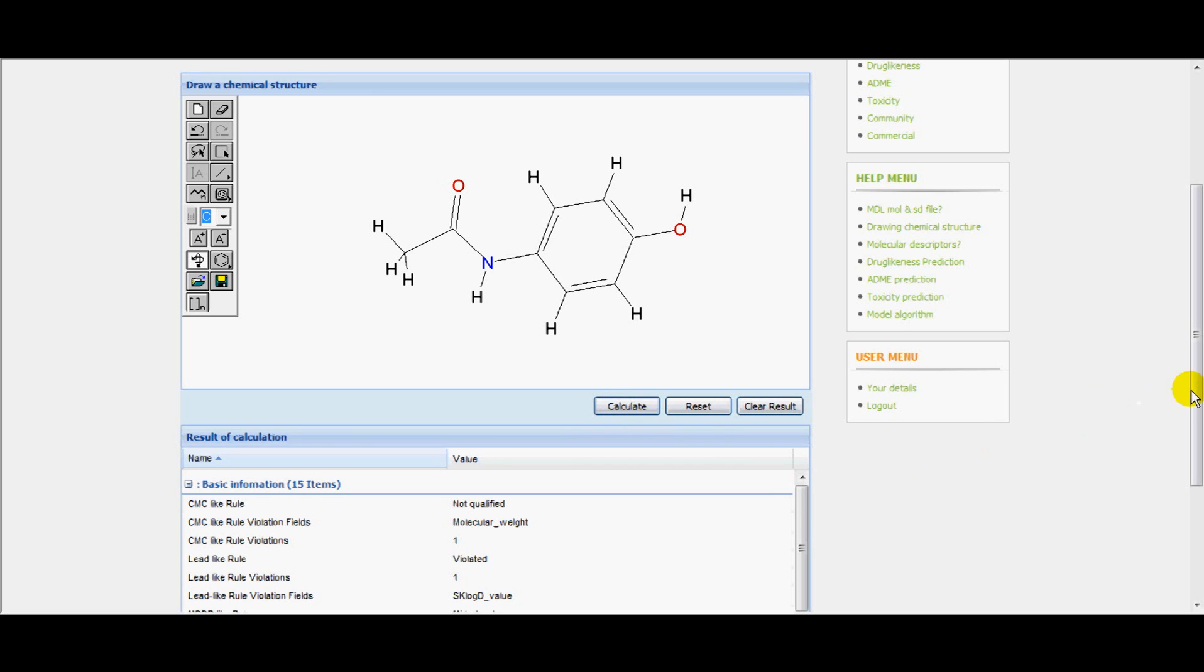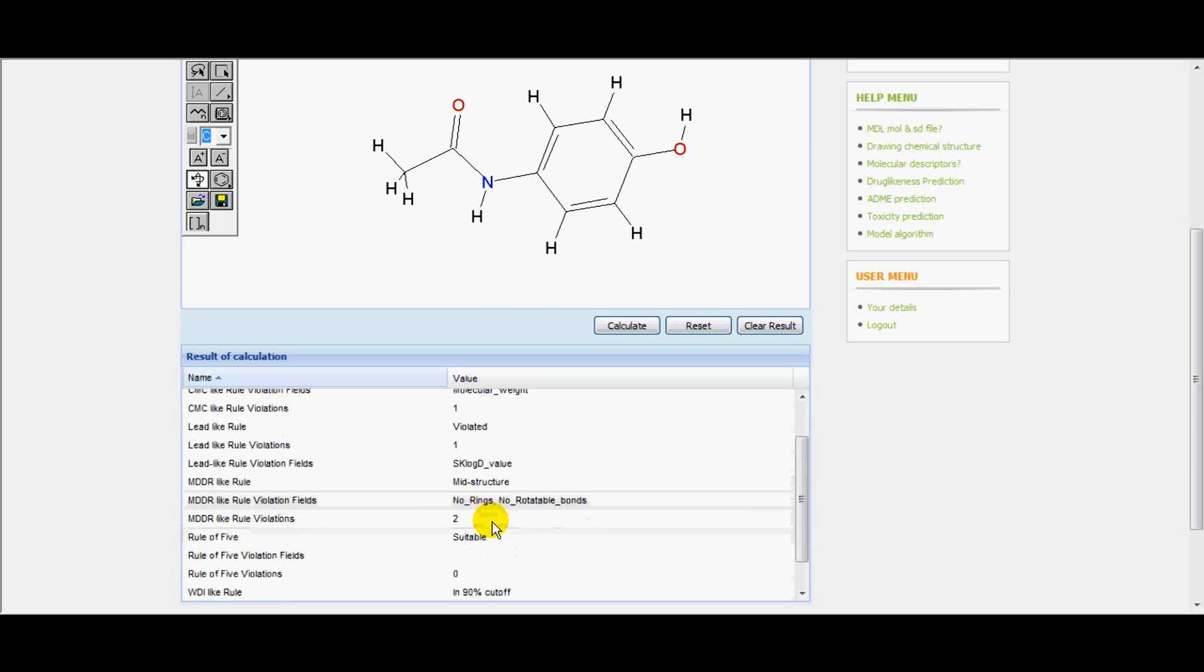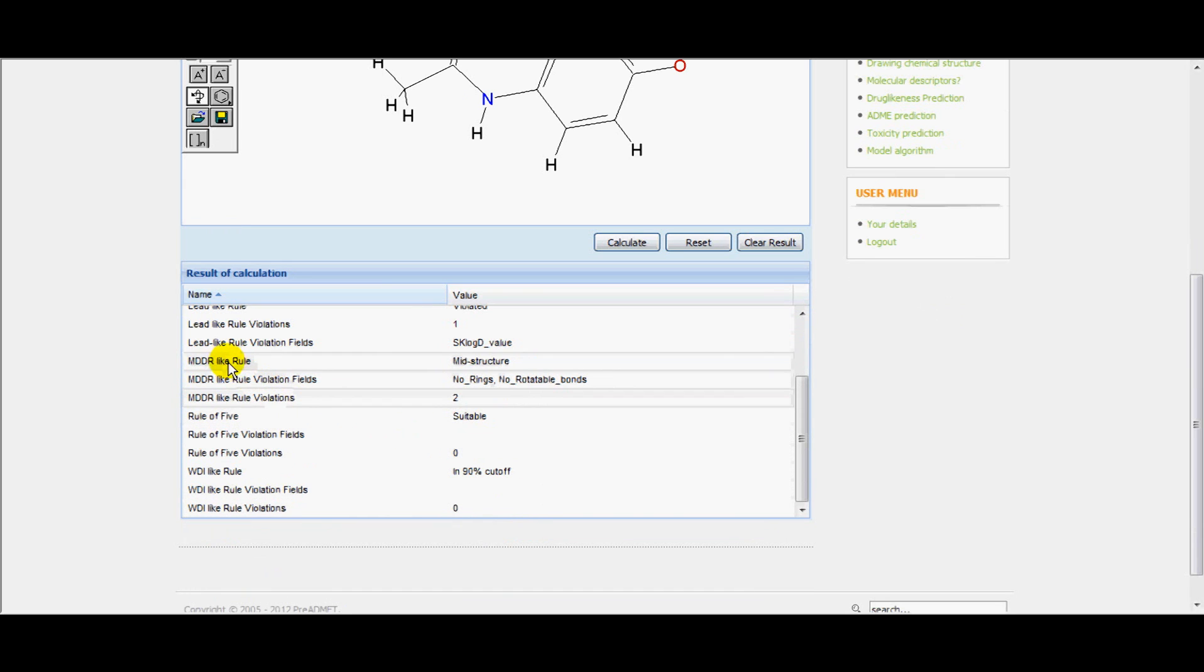Now click on the calculate button. In the result, all the values of calculation are displayed with CMC-like rule. It is not qualified. Its violation field is molecular weight. Like that, LEAD-like rule violations, MDDR-like rules violation, rule of 5 and WDI-like violations also given. Now we can copy the result and paste into a document for further comparison.